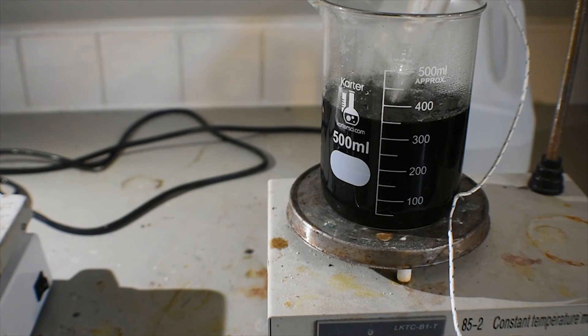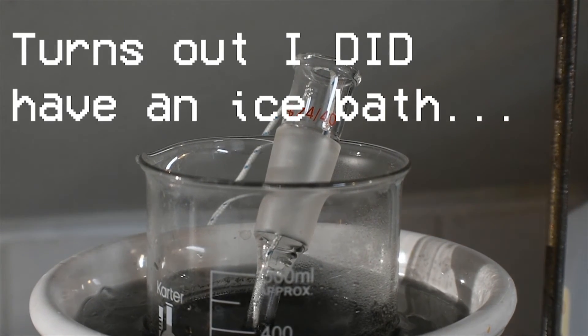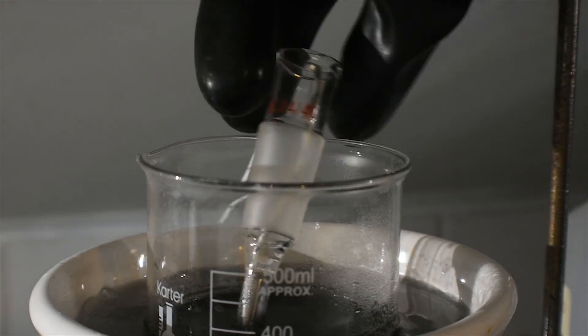Now everything's done heating. All I have to do is let it cool down, and since I don't have an ice bath, I'm just going to put it outside for an hour or two. Now that everything's cooled down to room temperature, we just need to filter it.